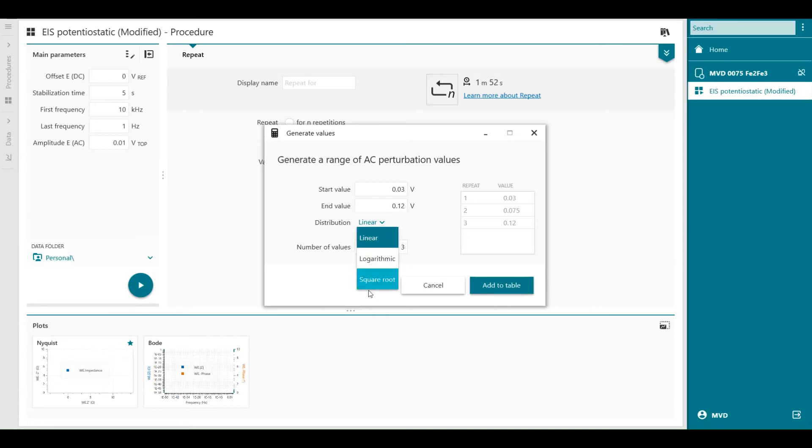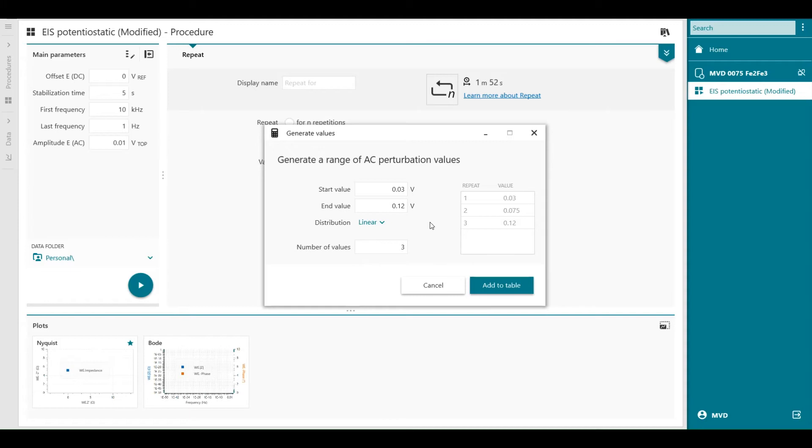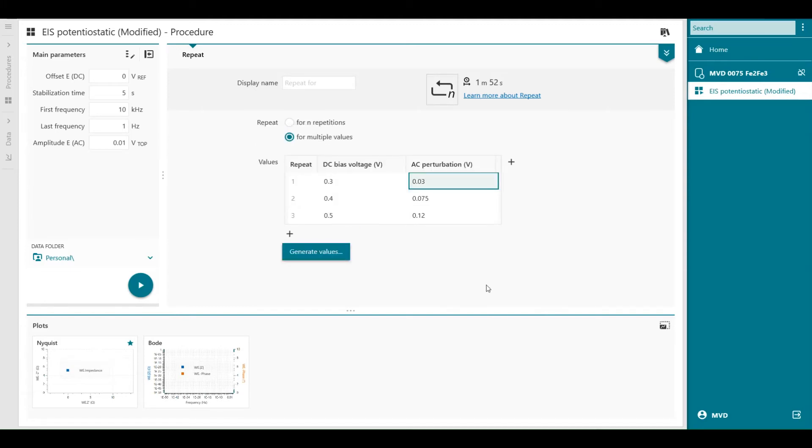Linear distribution. You can also select logarithmic or square root, but for this case we do linear. And three values in between, so number of values is three values in total. Add to the list. Now I have created my table. So I have my DC bias voltage and my AC perturbation.